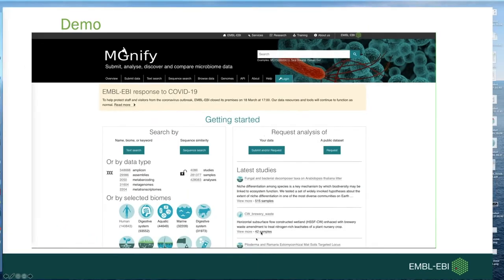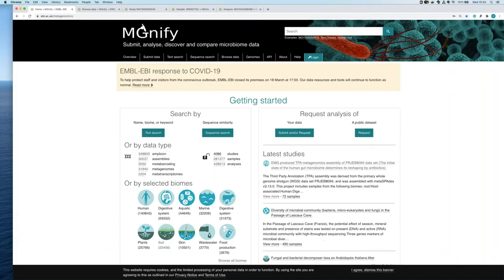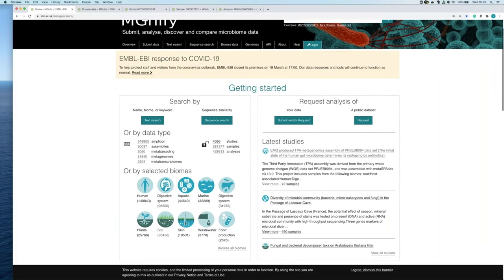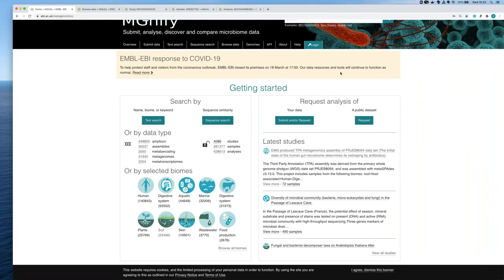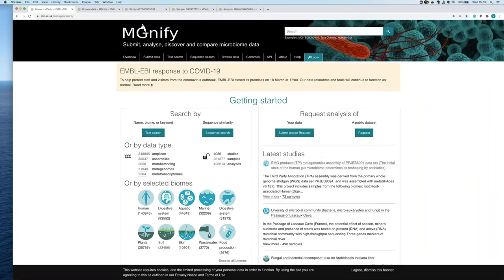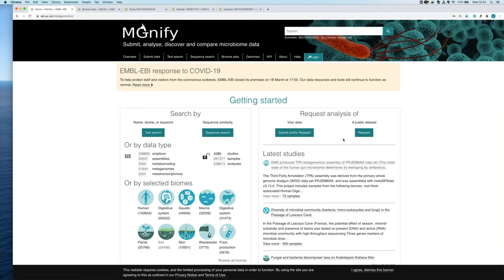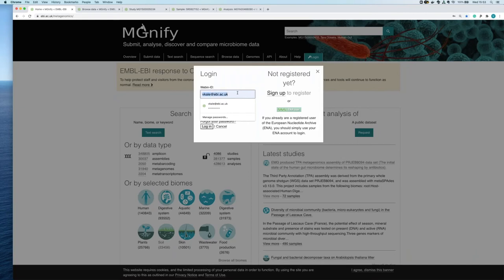Now I'll switch over to the website and give you a run-through of how to navigate it. This is the MGnify homepage — to submit a request for a public dataset click 'Request' here, or for a private pre-publication dataset use the other option. You'll need to log in with a Webin account, which we associate with each request. Everything currently on the site is public; if you have pre-publication data you've submitted, you can log in with your Webin account to access it.